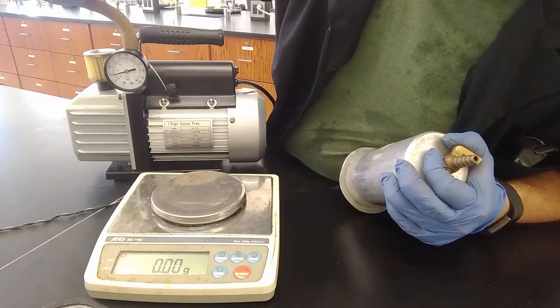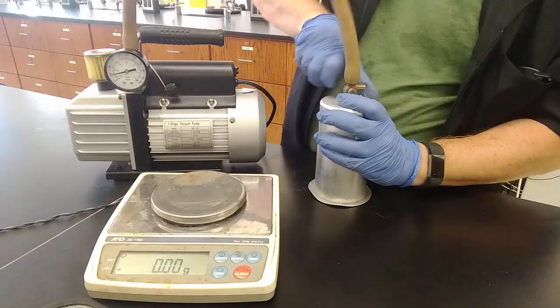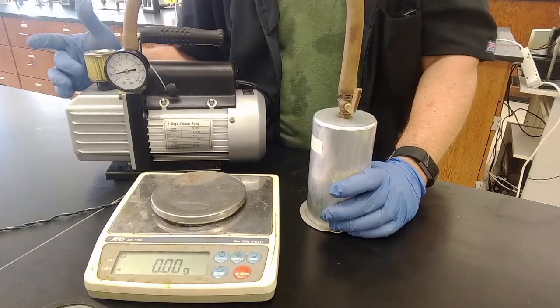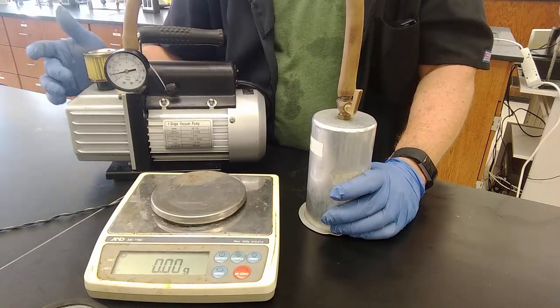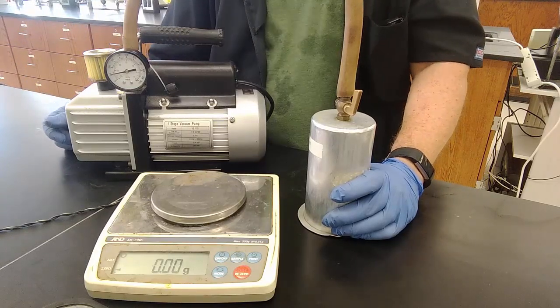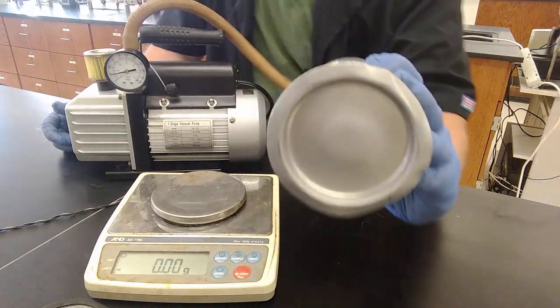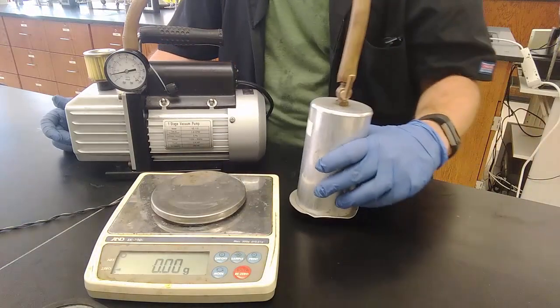Yeah, so our gauge appears to be broken. So we're just going to put it back on here and just give it a good minute of pumping down, as they say. Sometimes some smoke comes out of here. It's just hydraulic oil from the pump escaping. The filter is on there to try and prevent that, but you just wouldn't want to inhale it. But otherwise, a relatively safe procedure. This thing has got some nice thick walls to it, so it can't collapse. You might see that the bottom is curved a little bit so that it doesn't implode.